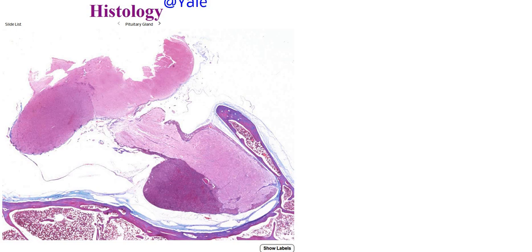So we have here the hypothalamus and the pituitary gland. To orient ourselves, we want to find this piece up top. This is actually part of our hypothalamus. There is not too much to know histology-wise about the hypothalamus. That said, it does have some important functions. The hypothalamus is our endocrine control center. It is maintaining homeostasis for the entire endocrine system. So it is very vital to making sure our hormones are maintaining that homeostasis.